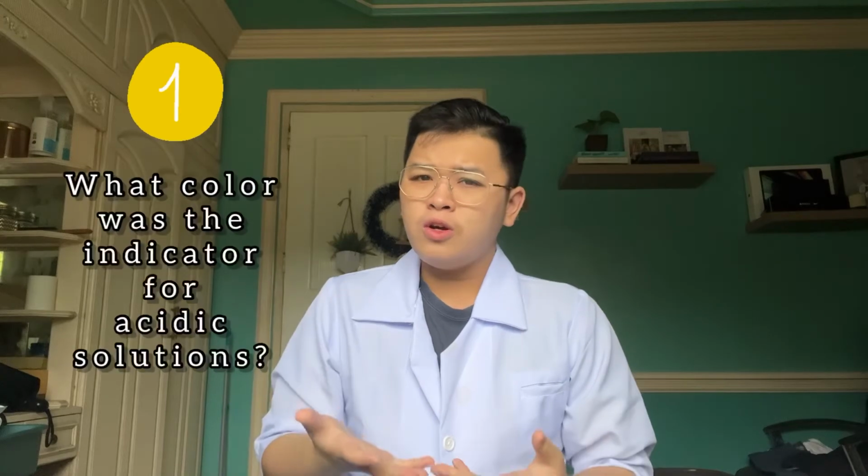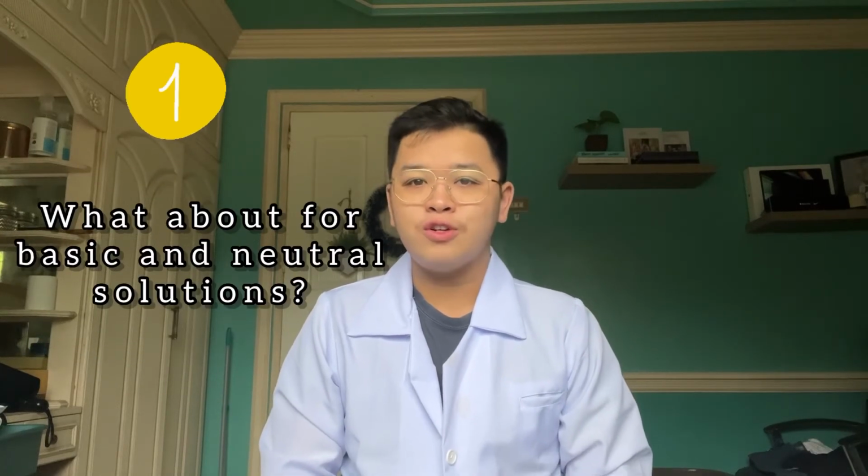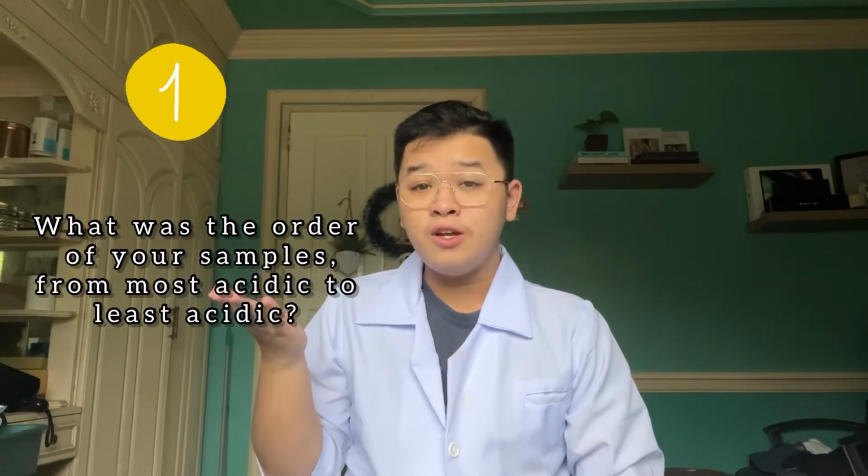For our results and discussion portion, we will be answering questions regarding the experiment we have just conducted. Number 1. What color was the indicator for acidic solutions? What about basic and neutral solutions? What was the order of your samples from most acidic to least acidic? The color of the indicator varies with the different substances used in this experiment.